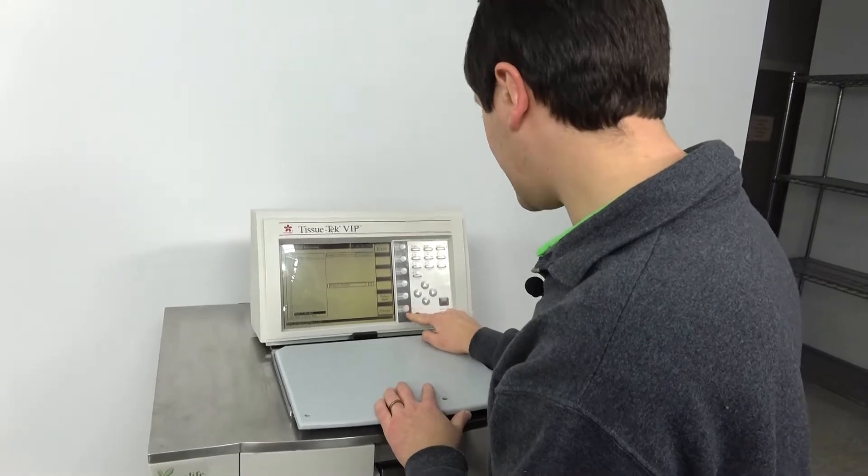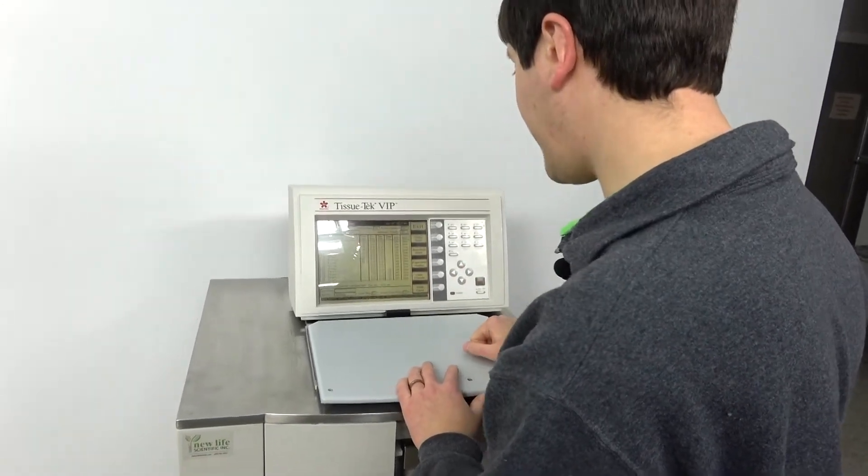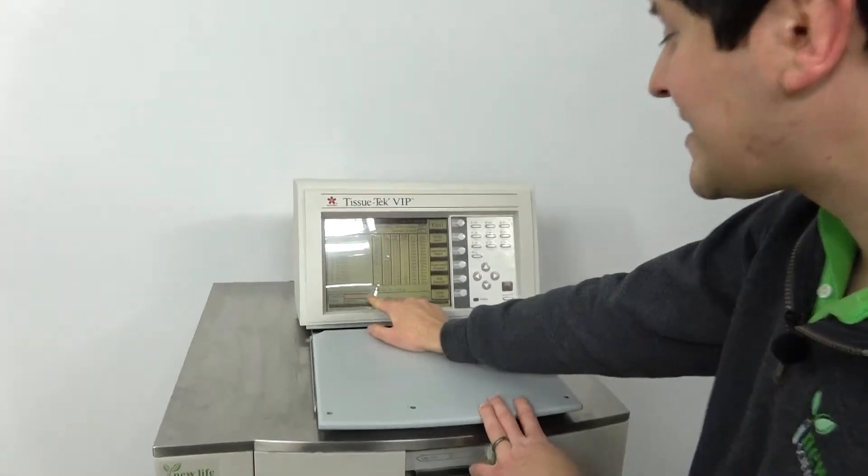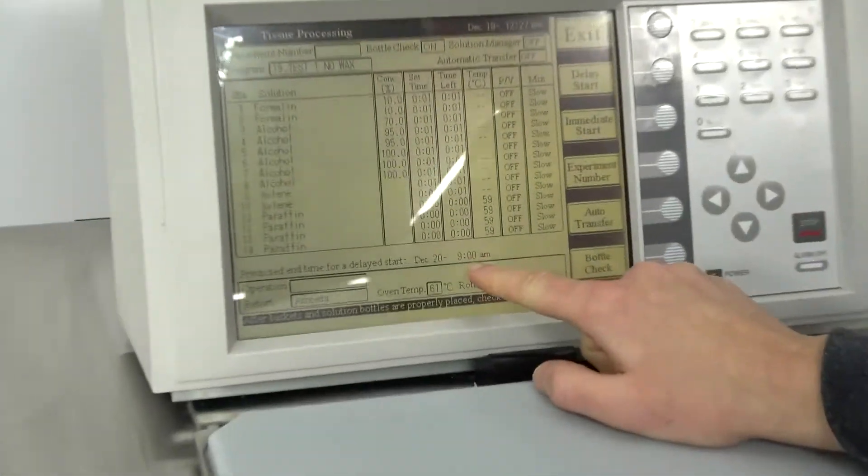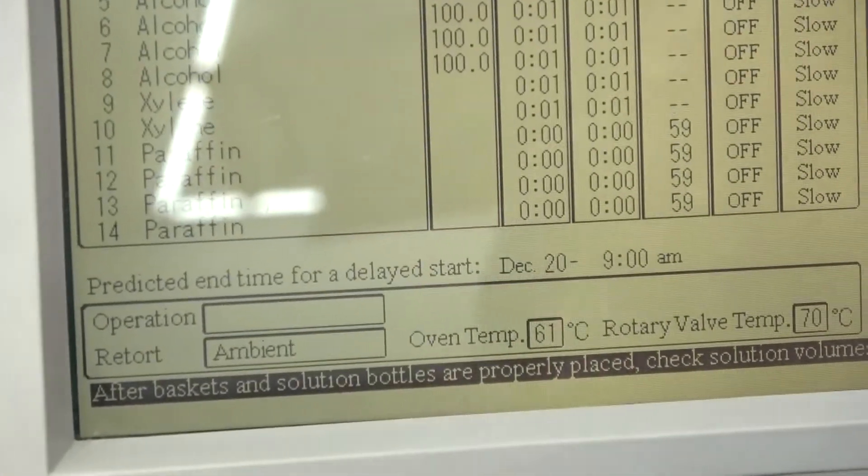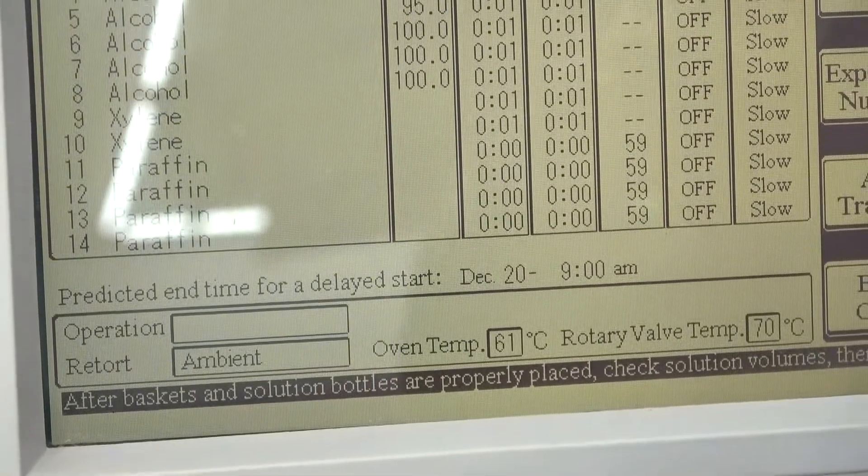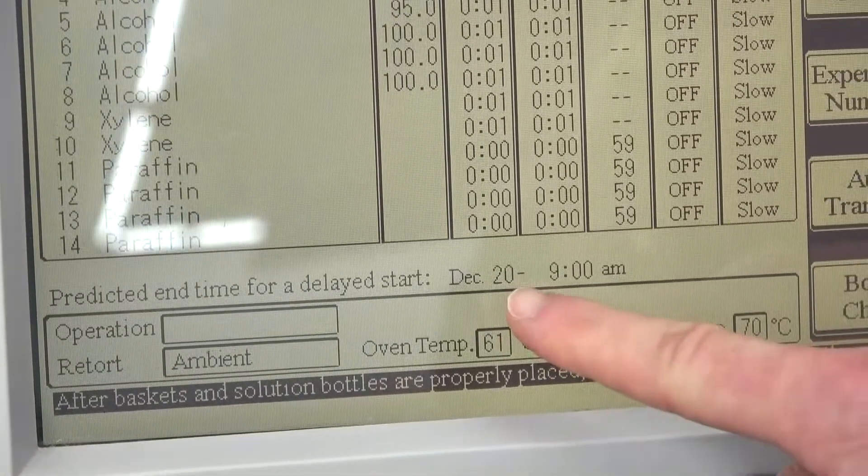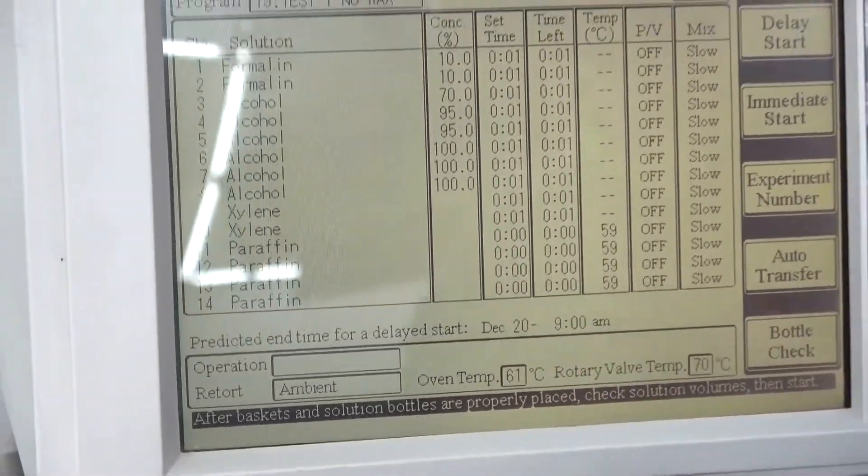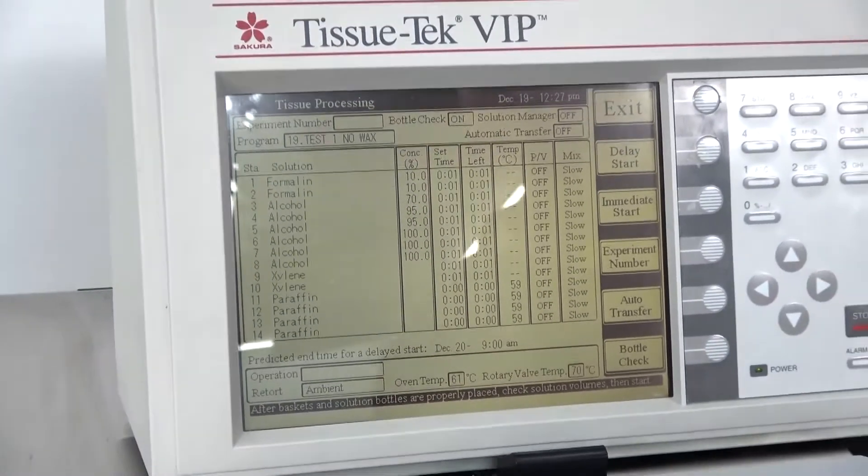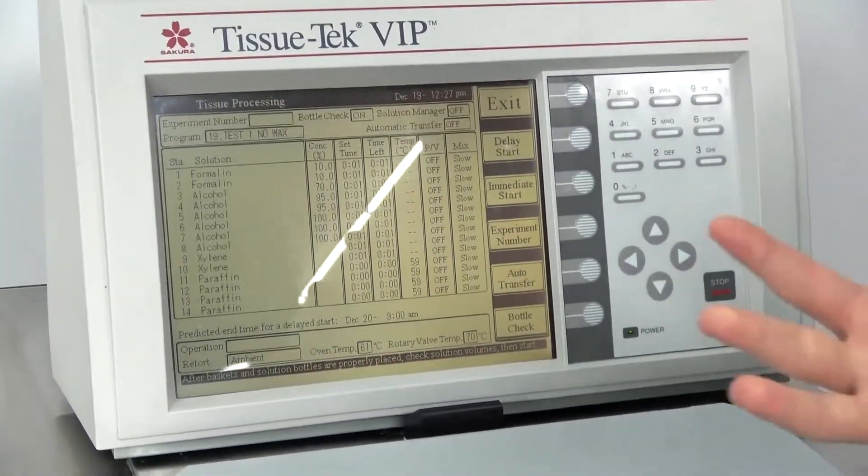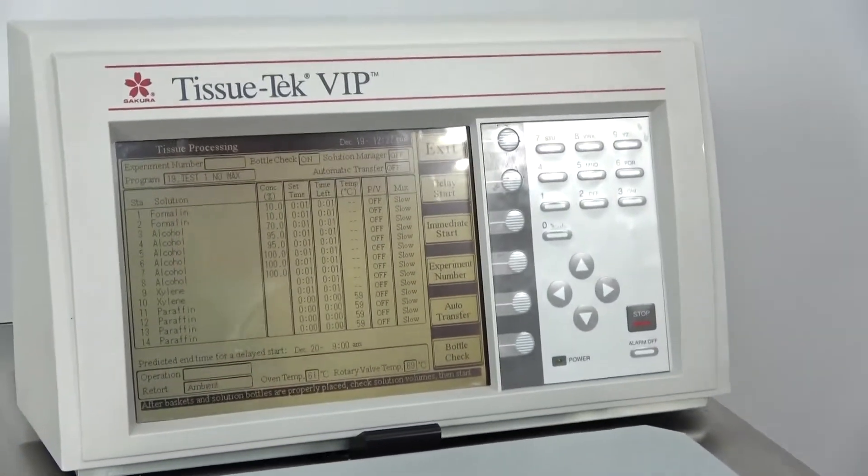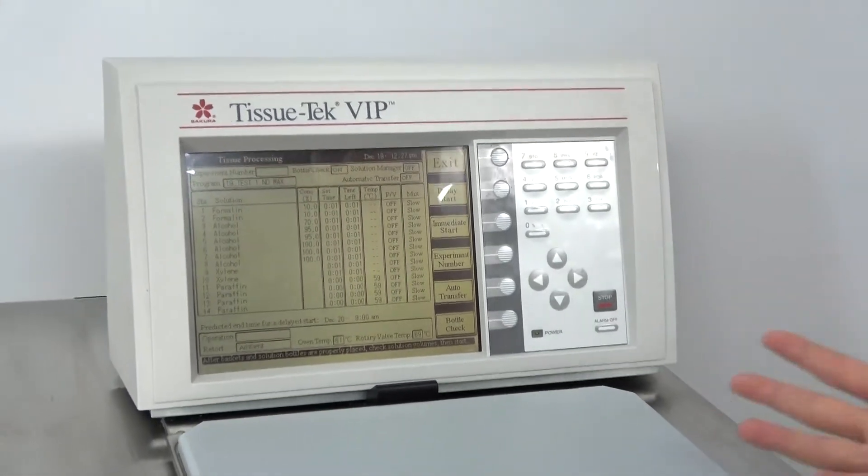Choose this no wax program that we have in here. And there you go. See there's a predicted end time for a delayed start. 9 a.m. So you can choose a delay start and boom it'll tell you what time it's ending. It also gives you the date in case you're skeptical. Is this thing going to do like a 36 hour run? So this tells me hey this thing will be done at 9 a.m. and I'll know it will be ready for my techs the next morning.